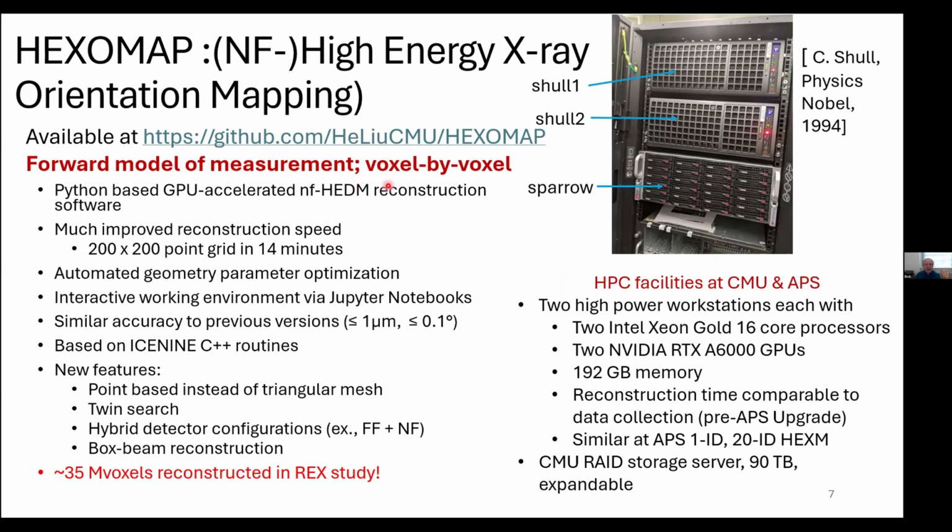And I'll show you that there's a lot of information you can glean from the data by doing the reconstructions this way. Just as an example, in one measurement, we had to reconstruct something like 35 million voxels to start to do the science of the measurement.